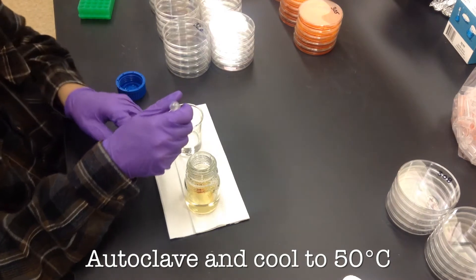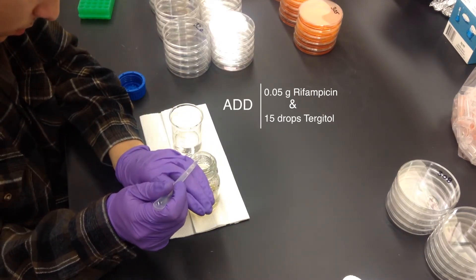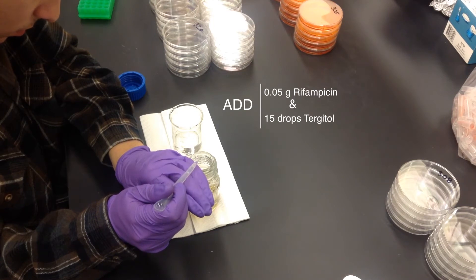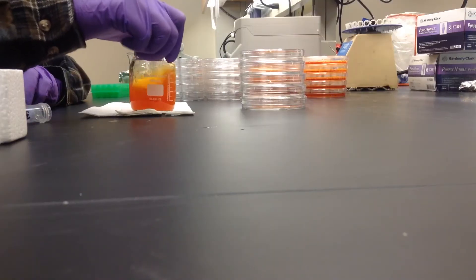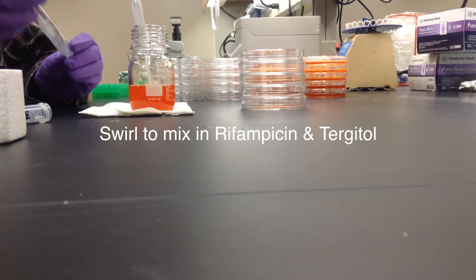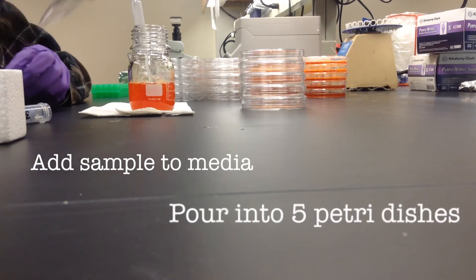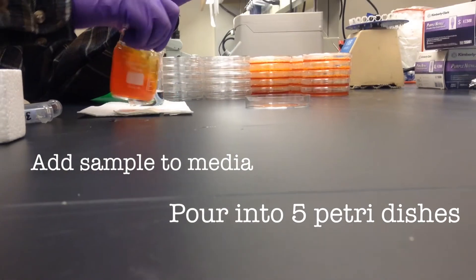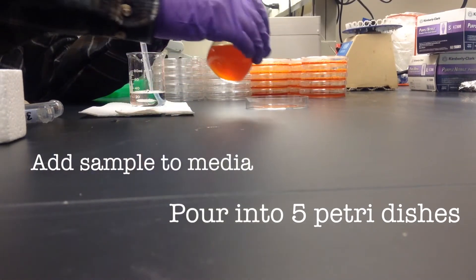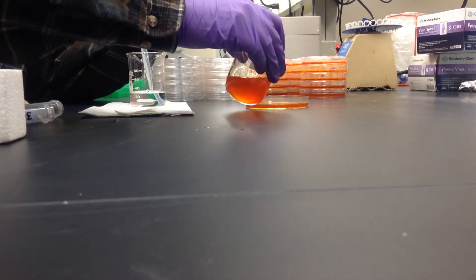Once the PDA has cooled to 50 degrees Celsius we're going to add rifampicin and Tergitol to the mixture. Once those have been mixed we'll add the sample to the media, mix it, and then pour it into five petri dishes which would equal 50 mils.